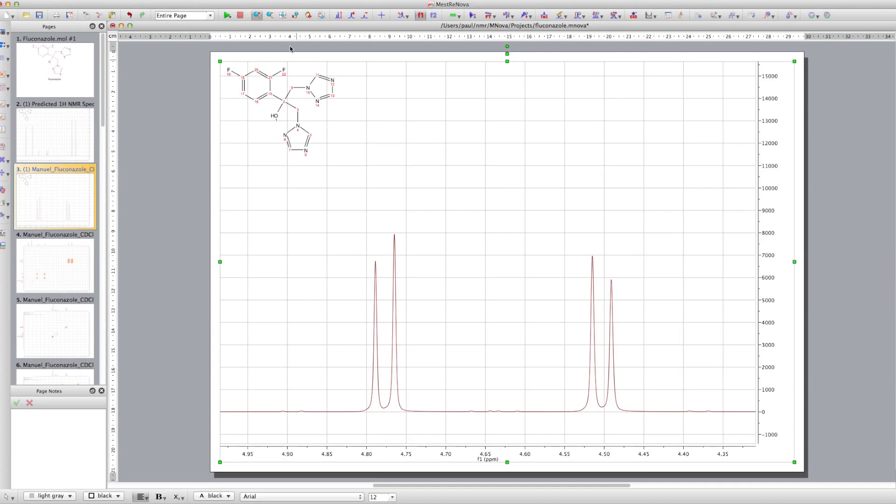And if you look at the real spectrum, we don't have single peaks for those CH2s. We've got doubling of these peaks. So we've got what look like doublets, and you can see they're leaning towards each other a little bit as well.